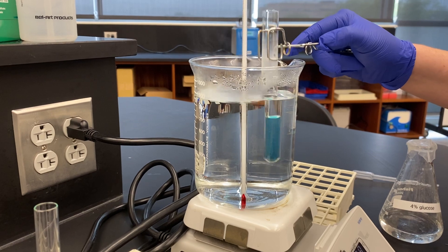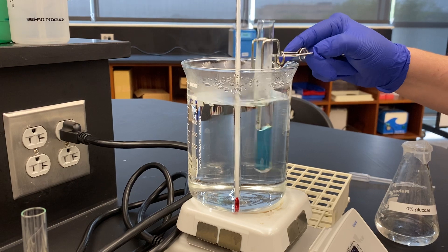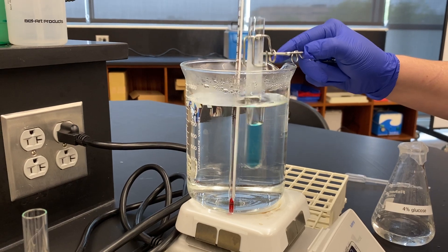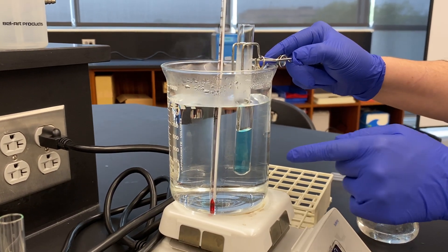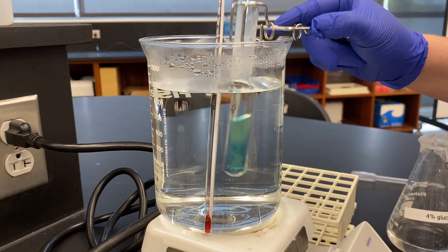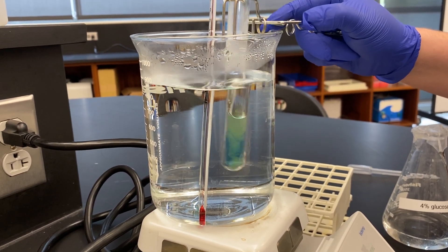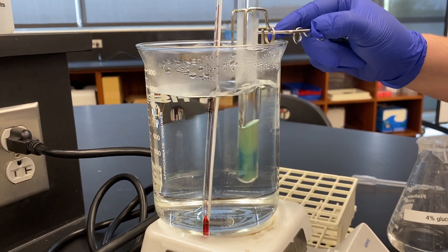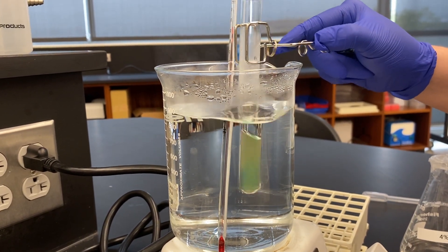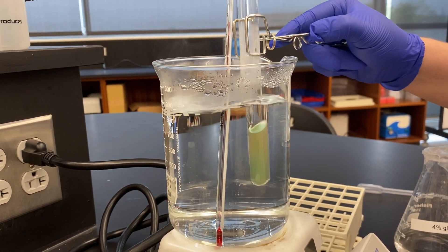If it stays green after three to five minutes, that's going to indicate a very low amount of reducing sugar. You can have a gradation from green to yellow to orange to red. And you can actually start seeing right now there's a development of green inside that tube — that's the reaction occurring between the copper and the glucose. You can start to see it turns a yellow color and it's going to continue to react.